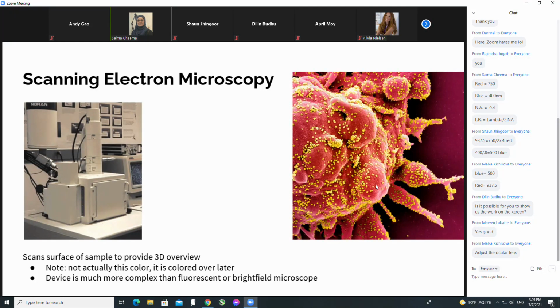And then in scanning electron microscopy, which not every lab has, it's going to use a beam of electrons to illuminate the object, and the specimen has to be prepared very, very differently. Generally, the specimens would have to be prepared using heavy metals so that they actually trap some of those electrons. And so you can have dense looking regions and lighter regions, and dense regions would be where the electrons are absorbed, and the lighter regions are where the beam of electrons passes through. So in scanning electron microscopy, we're just looking at the surface of the specimen.